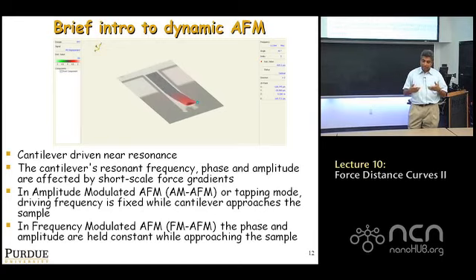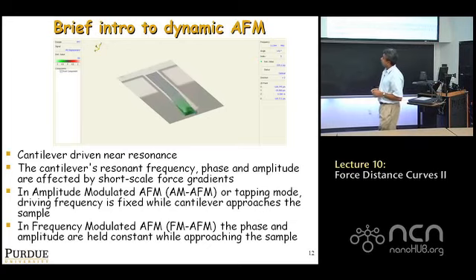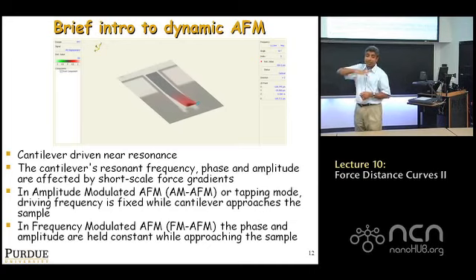And when you do dynamic AFM, you choose to drive it at one particular eigenmode typically. This is what's called the fundamental eigenmode, right? It's oscillating like this, but at a very specific frequency. So this is a dynamically evolving shape. Now it's going up and down, changing with time. However, you can show that the temporal motion is basically a sine wave, but the shape just evolves up and down. Although the shape looks very much like what you might expect when you apply the point force at the end, it is not described by a cubic polynomial.